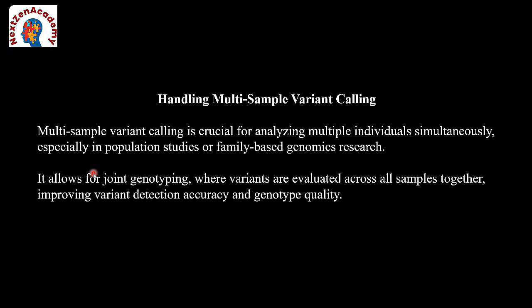And if you want to do filtering with a VCF file, here is, sorry, VCFtools. This is called VCFtools. Minimum quality, minimum depth, recode, output filtered.